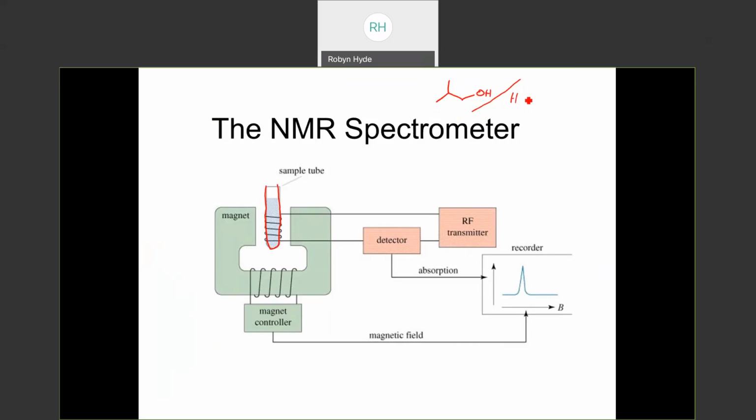Oh yeah, I could probably dissolve it into water. But what kind of NMR are we doing? So Mariah, you're already shaking your head. What do you see as the problem? Well, actually you're highlighting one potential problem that could happen, and I'm going to go there in just a minute. Any other problem that you see?